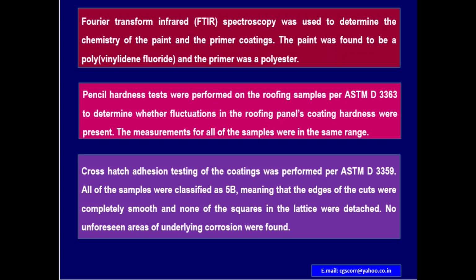Further, cross-hatch adhesion testing of the coatings was performed as per ASTM D3359. All the samples were classified as 5B, meaning that the edges of the cuts were completely smooth and none of the squares in the lattice were detached. No unforeseen areas of underlying corrosion were found.